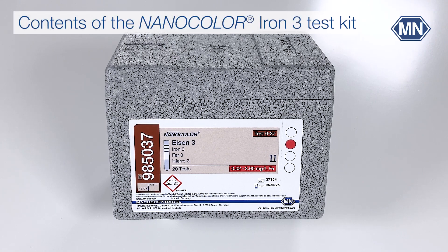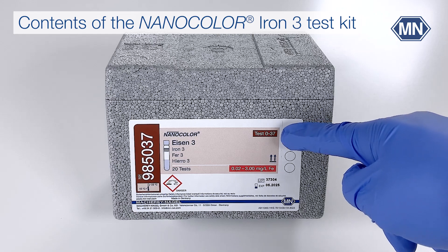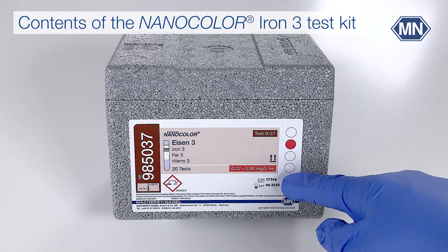All Nanocolor tube tests are labeled with the parameter — in this case iron — measuring range, test number, batch number, and expiry information.